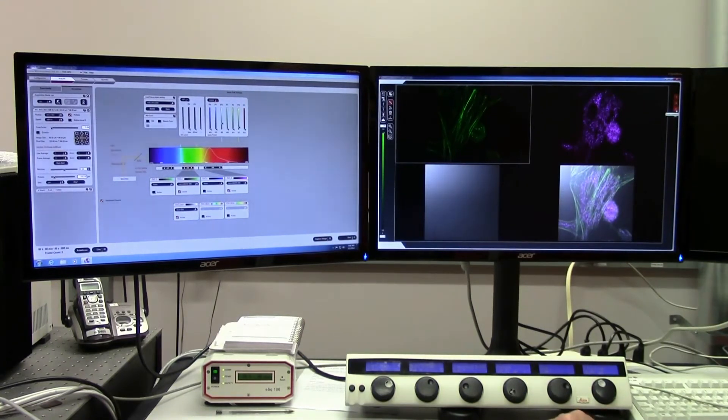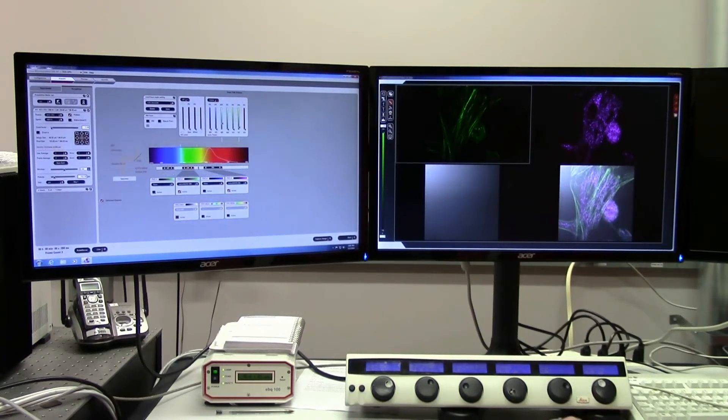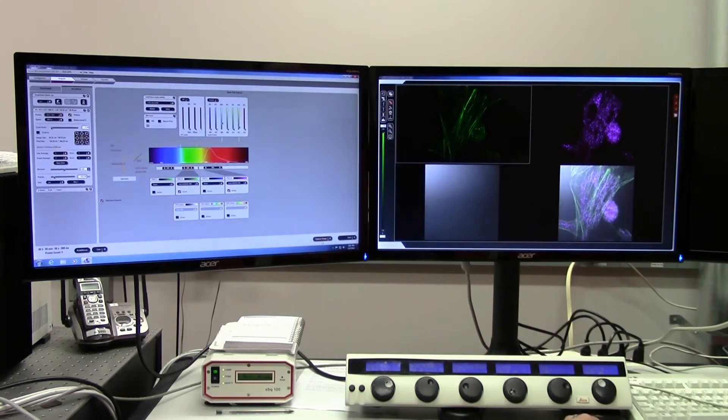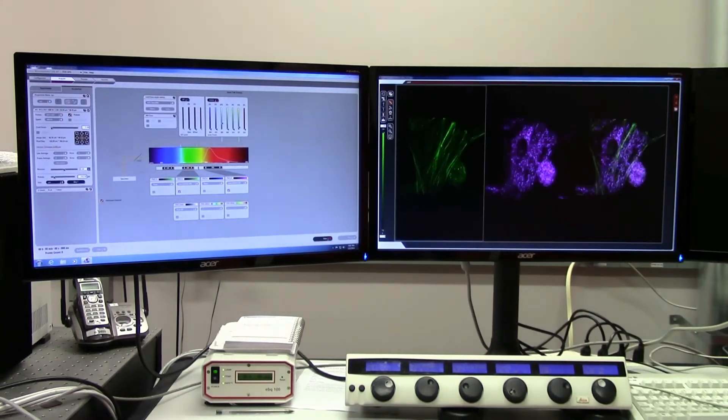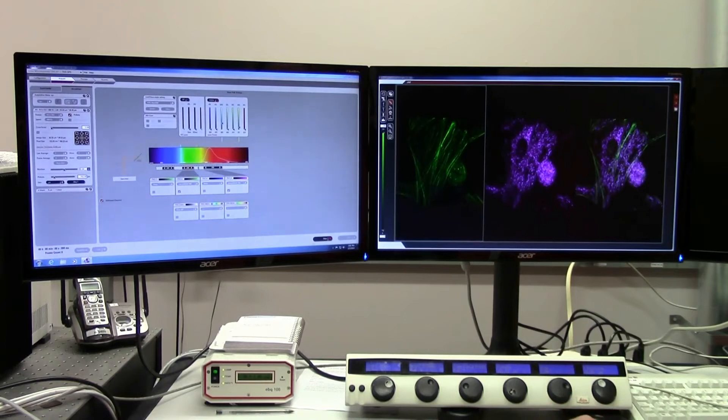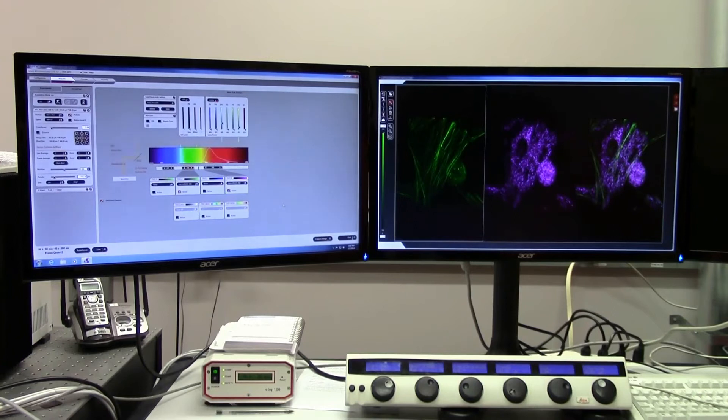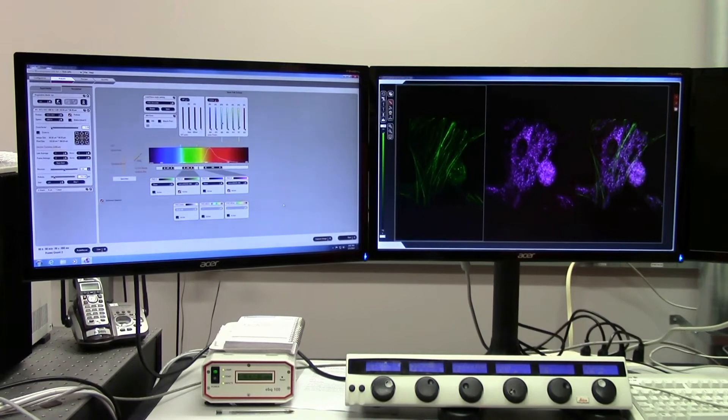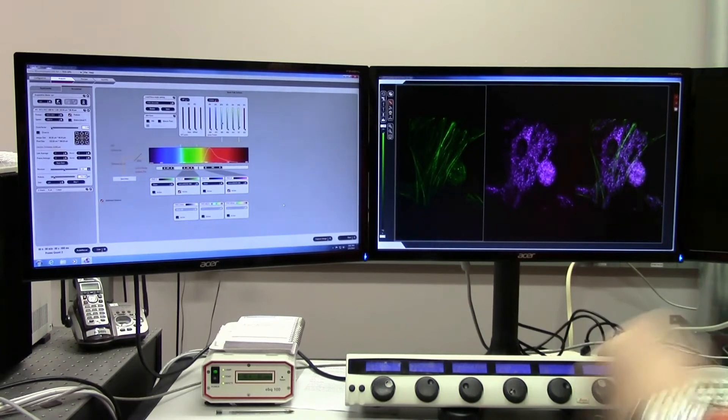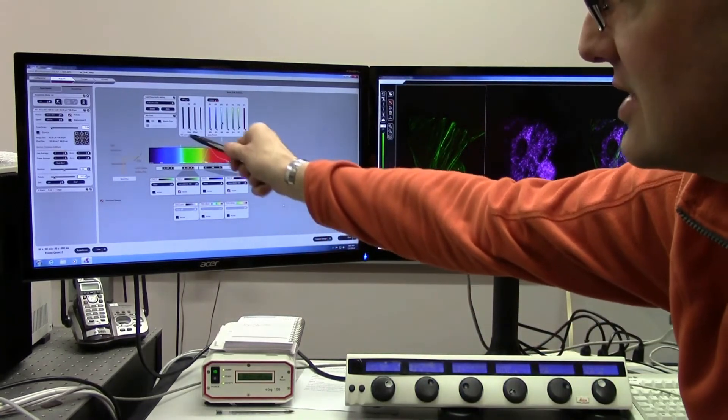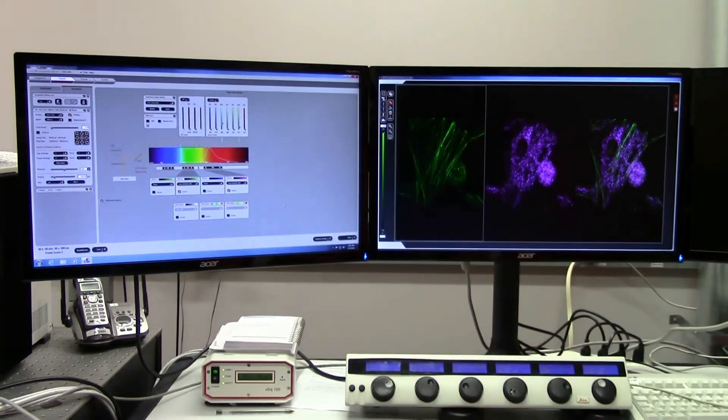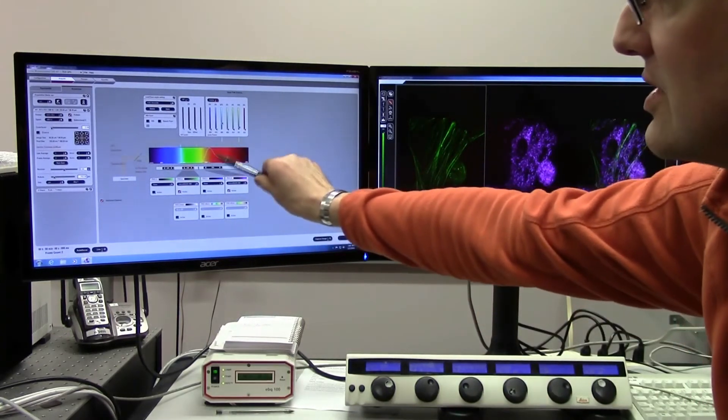For the remainder of this experiment, we're going to turn off the DIC channel. I'm going to capture an image with no DIC now. We're going to start addressing some of the artifacts that can occur when you're doing confocal imaging. One of the biggest problems with laser confocal imaging is due to the extreme intensity of the excitation light source and the variability of dyes.